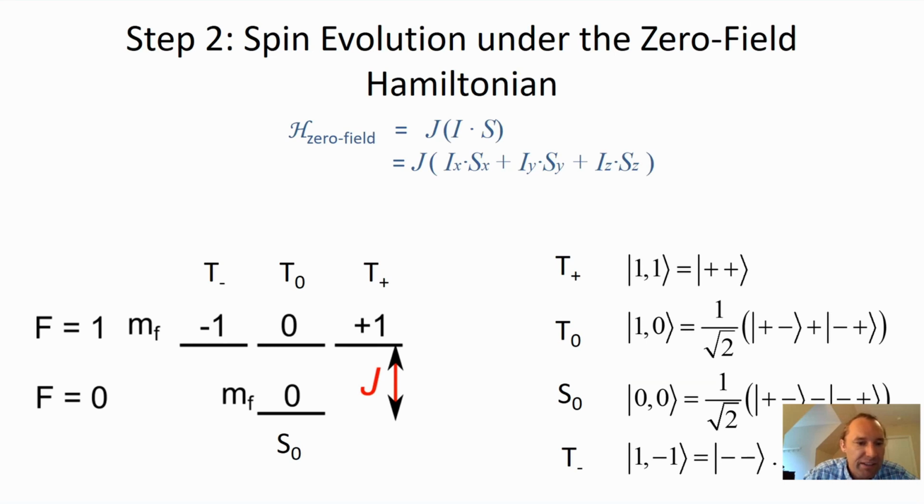And we name these eigenstates. We name them singlet state. T minus, T0, and T plus are the triplet states. And we can depict them also in a Zeeman basis if we wanted to. That's on the right of the slide. So T plus is just the state associated with the up state, so both carbon and proton spin pointing up.